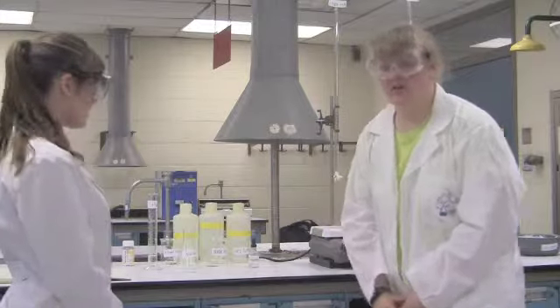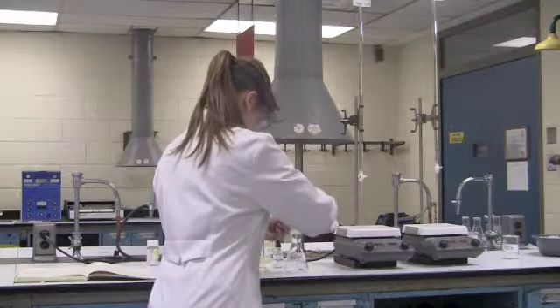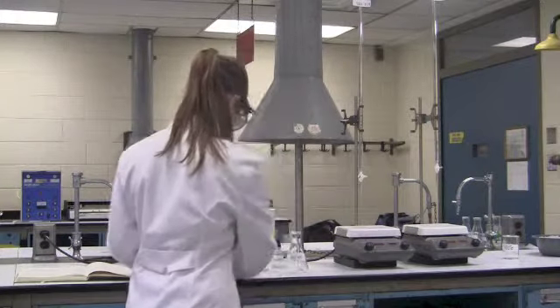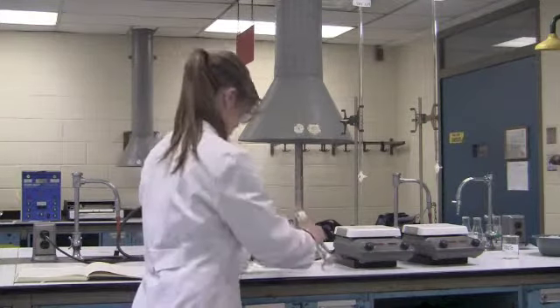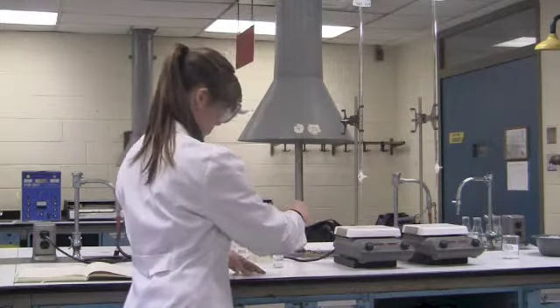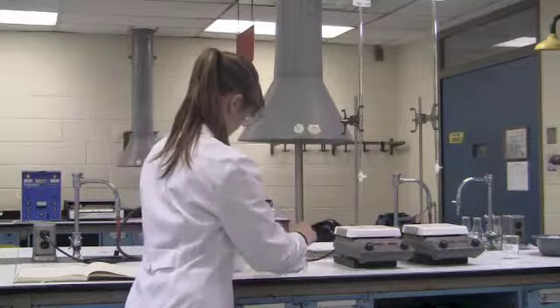Now we'll begin our titration. First, Taylor will take her .3405 gram sample and dump it in her Erlenmeyer flask, along with her stir bar. Now, she will add her 20 milliliters of ethanol. She will now stir that to ensure that all sample has been mixed thoroughly. Next, she will add her phenolphthalein indicator.